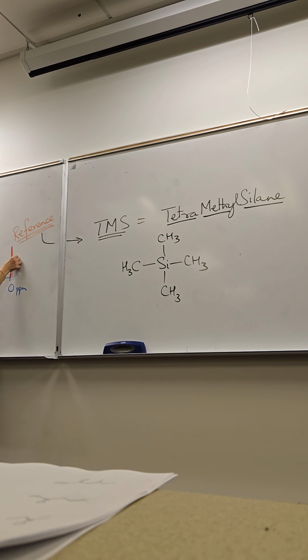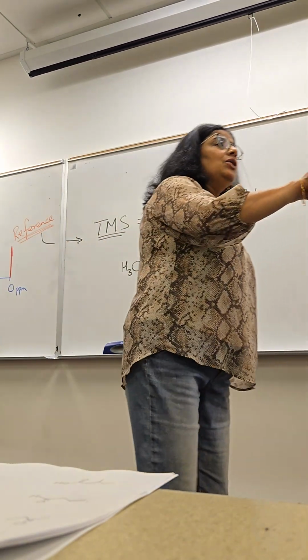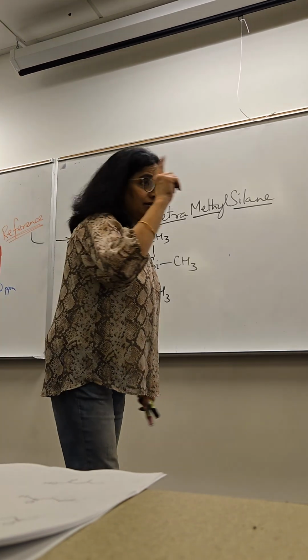Yes? So, in an NMR machine, do you load liquids or solids? Solution. Solids, no. They can be liquids, so if the compound is a liquid, best to run it neat. But if it's a solid compound, then we have to dissolve it. And that's my next point.